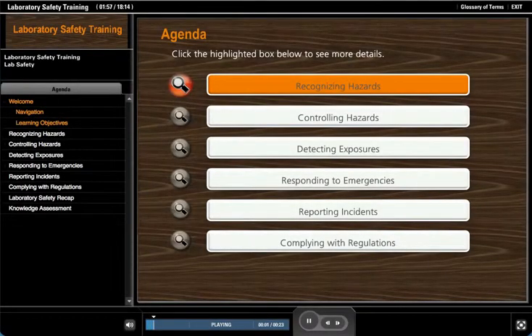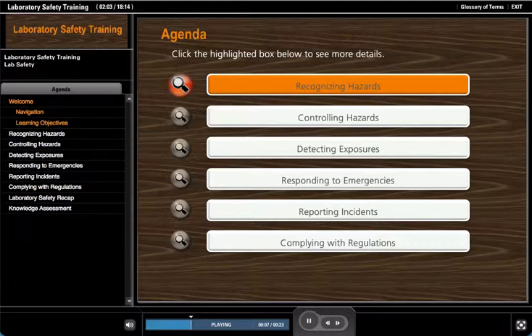From time to time you'll see this type of screen. This agenda screen allows you to easily navigate through the course. Click the recognizing hazards tab to see additional details on how to recognize potential hazards in the lab.